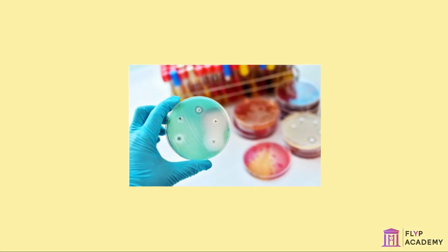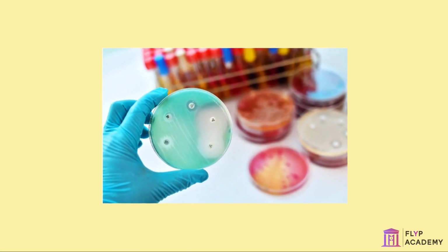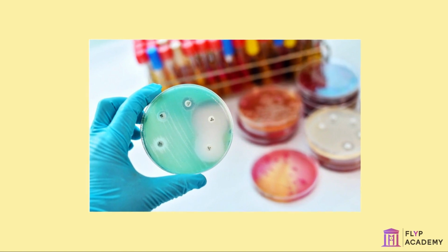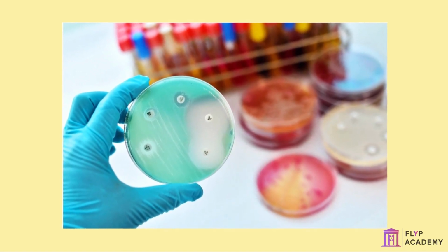The inoculation loop is heated to kill any bacteria that may be present on it. It should not be dipped into the bacteria for the culture until it has cooled, as it would kill the bacteria intended to be grown.